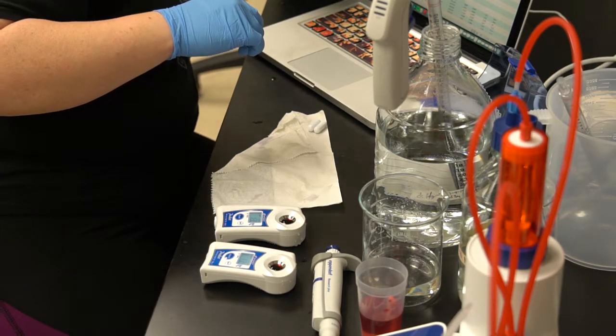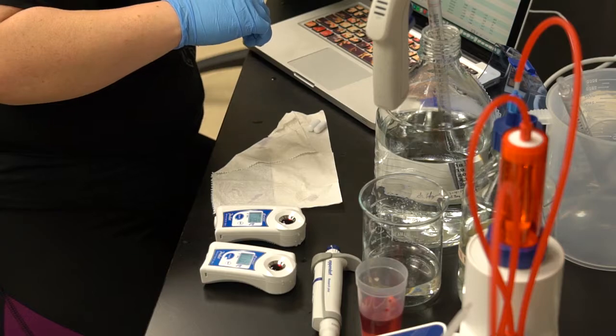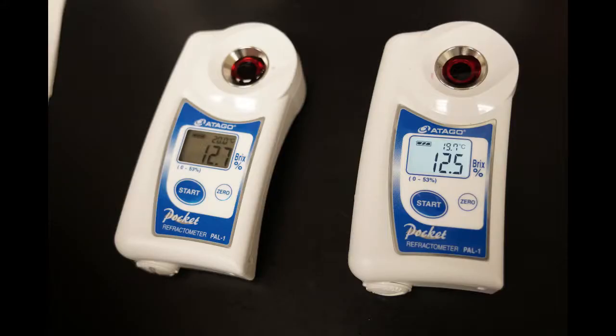In general, the higher degree of which light is refracted, the higher amount of soluble solids in the sample. The sugar concentration of an aqueous solution is expressed as degrees Brix. 300 microliters of juice is placed on the lens and a light is shown through the juice sample. Combining titratable acidity and soluble solids provides the sugar-acid ratio, an important factor in determining eating quality.